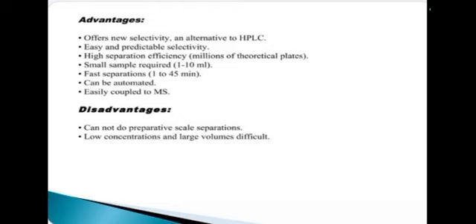Next we see the advantages of capillary electrophoresis. First one, new selectivity, easy and predictable selectivity, high separation efficiency. Fourth one, small sample required. Fifth, fast separation. It can be automated. Last one, easily coupled to MS. These are the advantages of capillary electrophoresis.